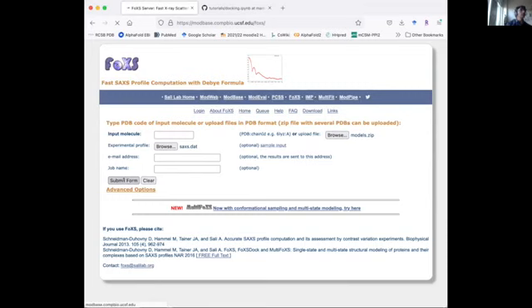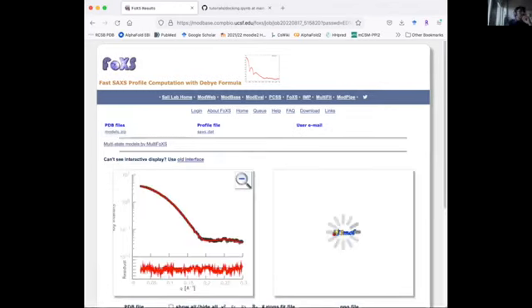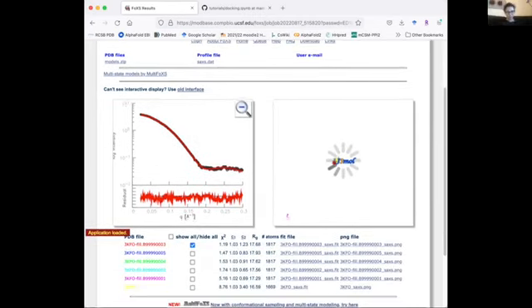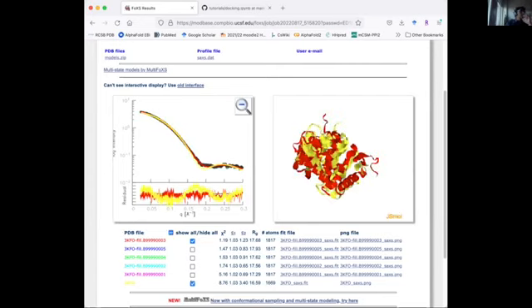I just want to mention that the zip file has both PDB files, the histag and non-histag. Maybe, I don't know. Maybe only histag. We'll see. Okay, yeah, it has both. Good. So the yellow one is the original one.